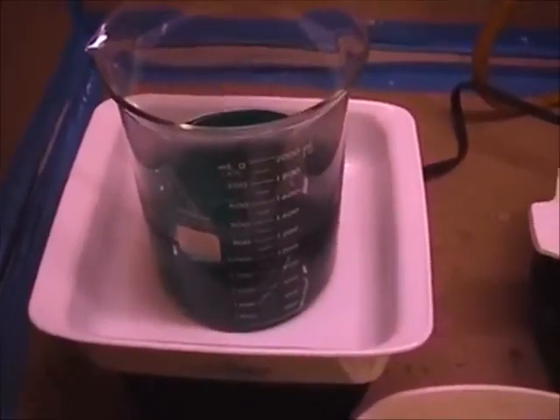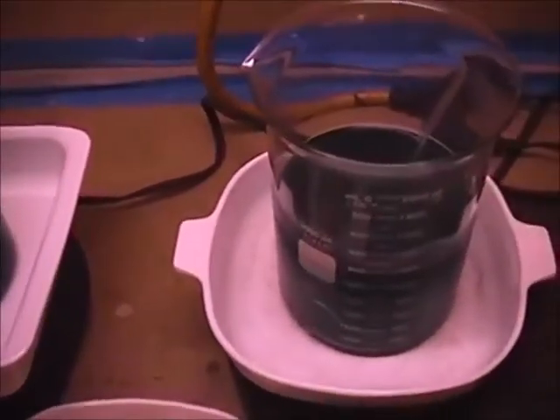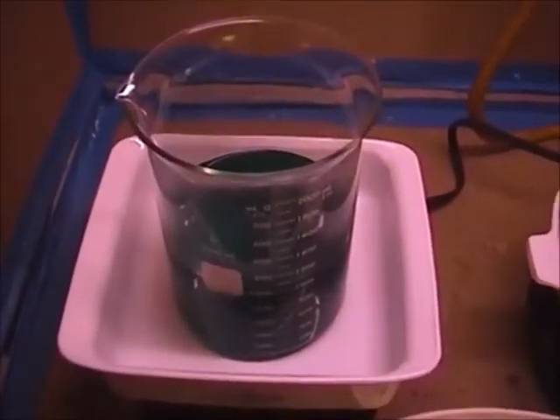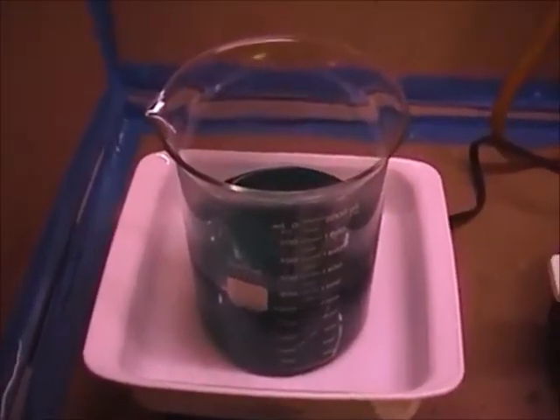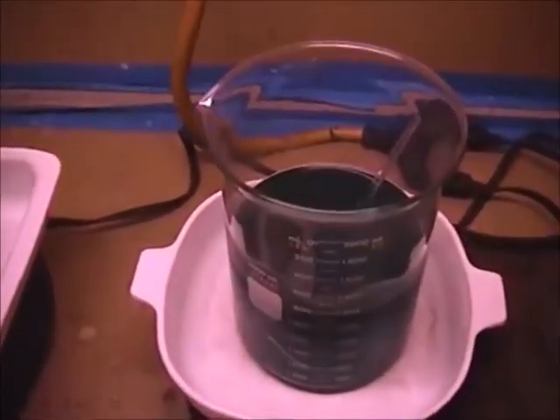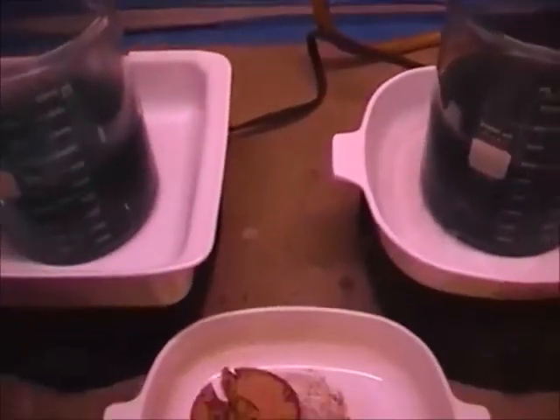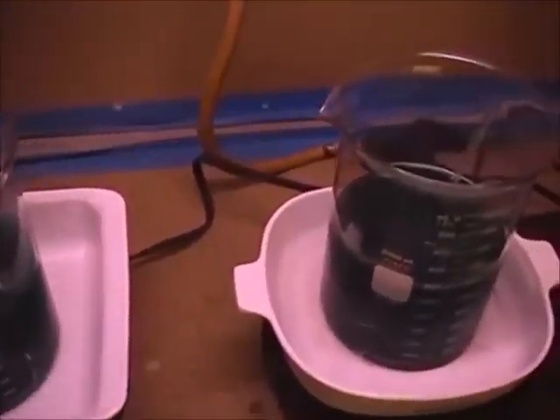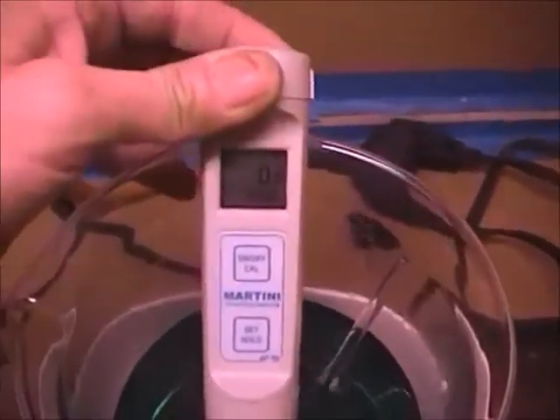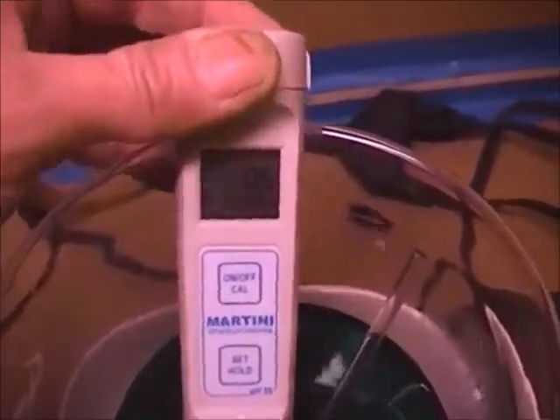Formate said 1.5. Some of the other patents I've read say 4 or a little higher. So I still think I'm within the margin of error. But that's what learning any new process is, just being very observant and learning what to do and what not to do. So let me move this out of our way here, and we'll come over here and get our pH meter. We'll turn it on, and we'll stick it in the solution and give it just a minute to balance out.